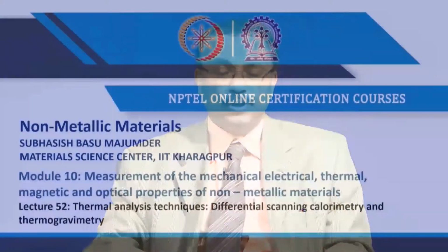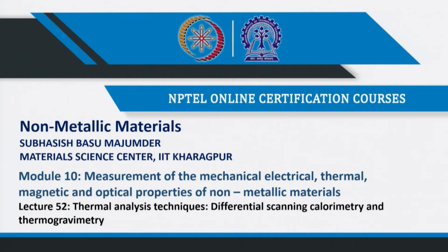Welcome to my course non-metallic materials, and this is module number 10, measurement of the mechanical, electrical, thermal, magnetic and optical properties of non-metallic materials, and we are in lecture number 52, thermal analysis technique, particularly differential scanning calorimetry and thermogravimetry. This I will be discussing.